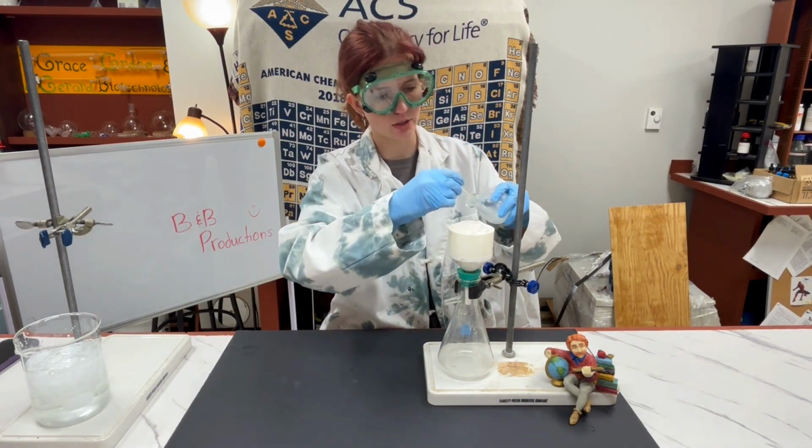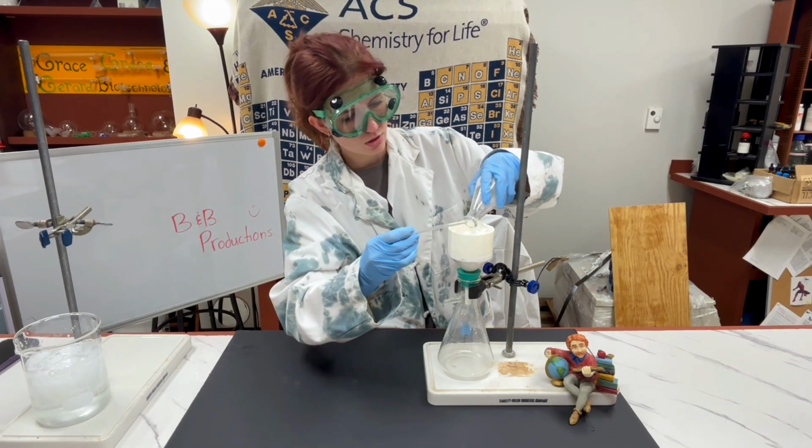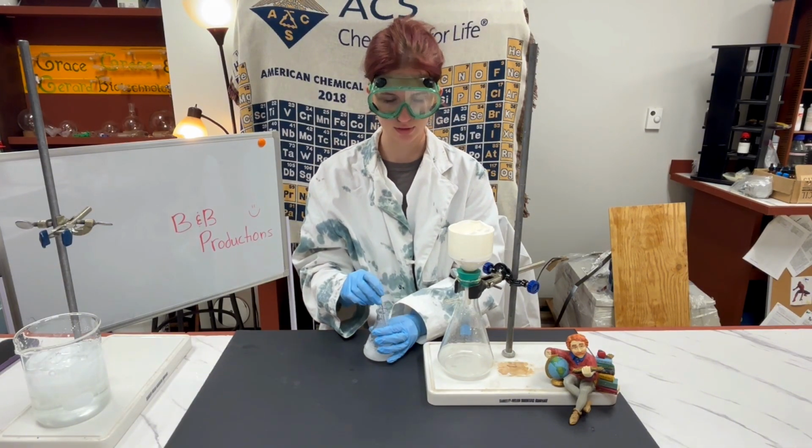Go ahead and dump it in here. And if you need to, you can use some of your solvent to wash out the remaining crystals in the flask.